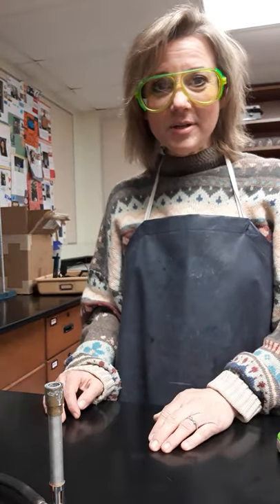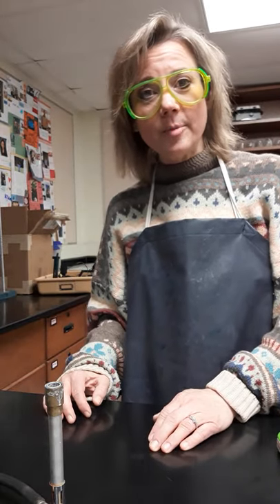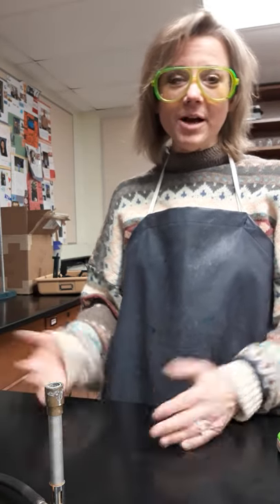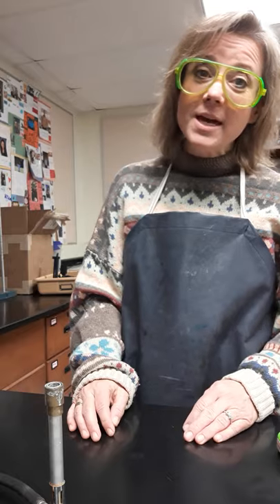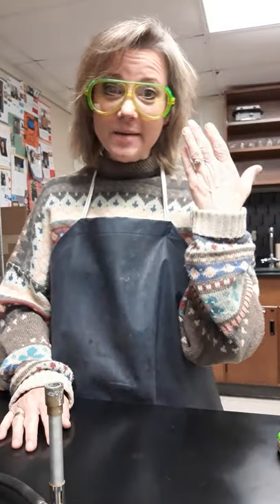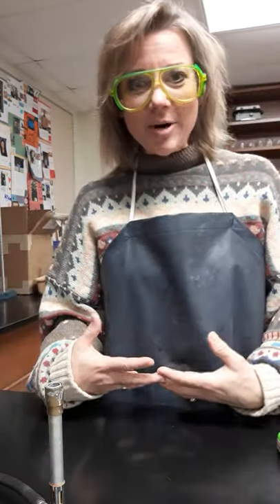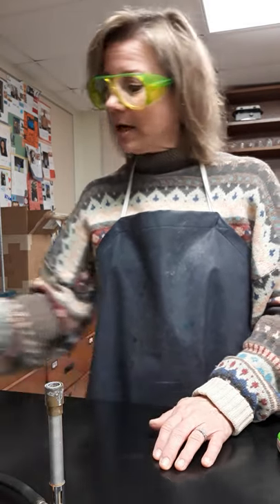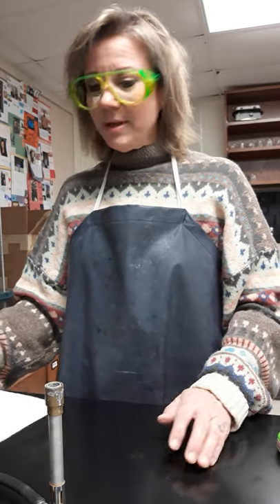Hello chemistry students. Today we're going to run the reactions that are a part of the chemical reactions lab, also known as 'you're just my type.' First, I want you to notice that I've done my goggles and I've done my apron, and now that I have all my safety equipment on, I'm ready to start.